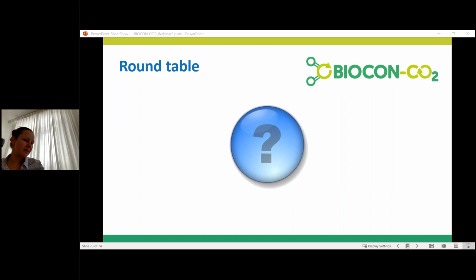Hello, yes, thank you for the question. This kind of definition, if it's a continuous system or non-continuous, is quite difficult for gas fermentation. So yes, the gas phase is a continuous system, but of course it's a batch-wise prepared medium. So in fermentation mode, you would say it's a batch fermentation, but we have continuous gassing.